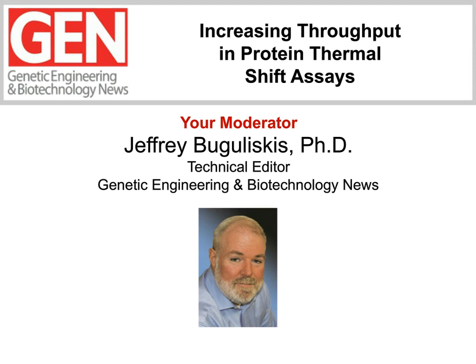Protein stability screening is often an integral component of the drug discovery process, enabling researchers to determine binding affinity and efficiency in the early stages of the compound screening process, thus allowing investigators to advance only the most promising proteins through to the next phases of development.